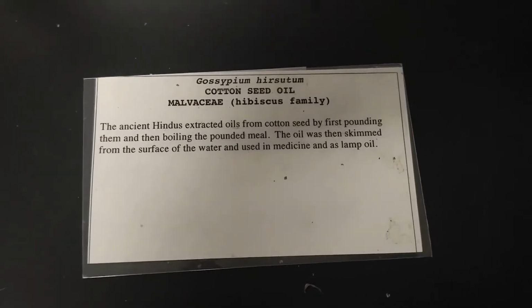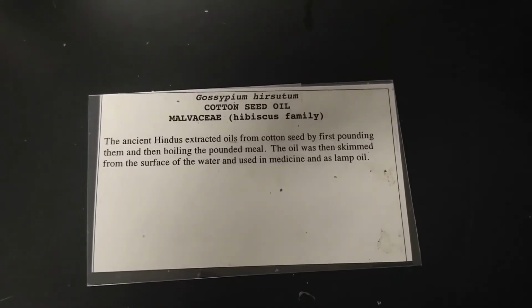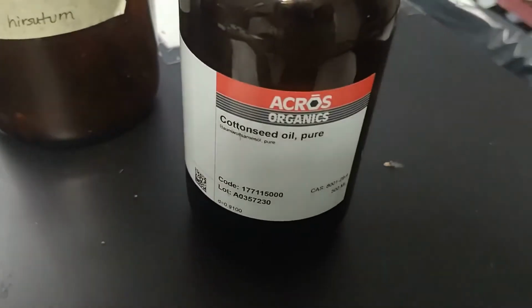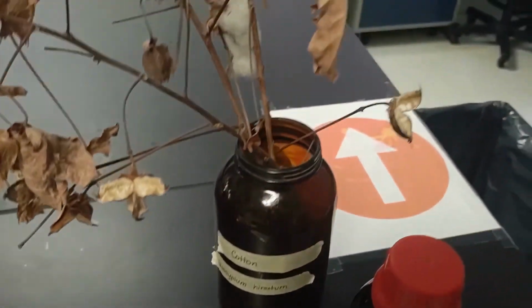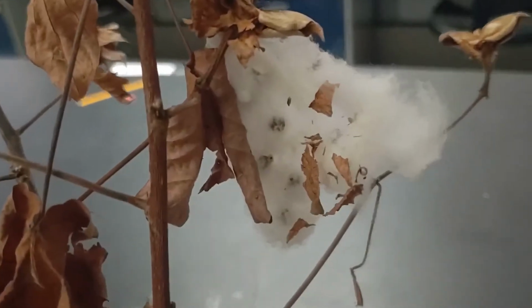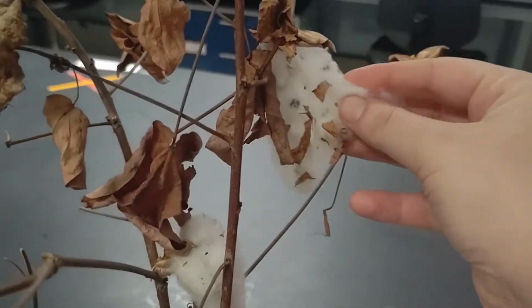Also in this lab we have cottonseed oil, and this was used as medicine and for lamp oil. So we have here a chemical grade cottonseed oil. We have cotton itself, so it is very fluffy. You can see the seeds, and it's so very soft.